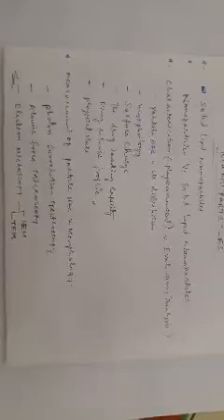We have one more type of light scattering that is not commonly used, but these two types, dynamic light scattering, abbreviated DLS, and electrophoretic light scattering, abbreviated ELS, are commonly used for various measurements of nanoparticles or nanoparticular dispersions using the Zeta sizer.